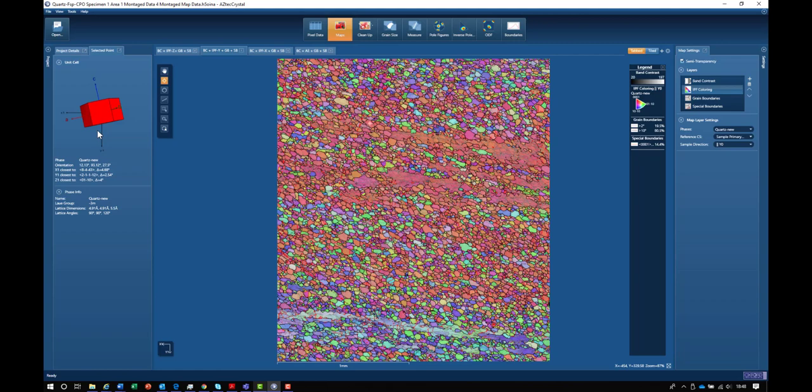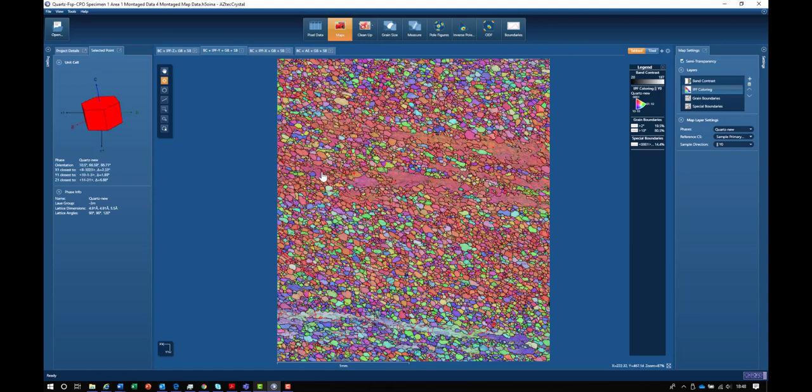We can see that the C axis, shown by the blue arrow, is roughly parallel to the map Y direction. This would be the same for all of the red colored grains that we can select in the map.